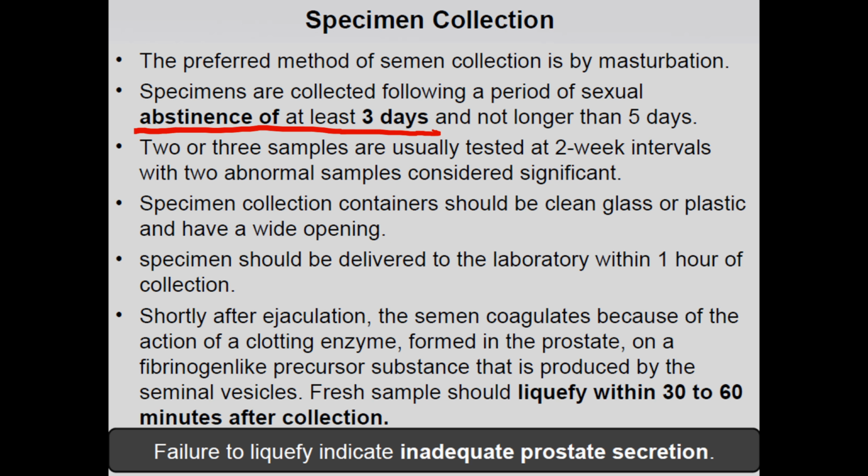So at least a 3 to 5 day abstinence period is very important. Why is it important? Now I am telling you. If a patient performs sexual activity within 2 days and comes to your lab for semen analysis, the sperm count is definitely lower.